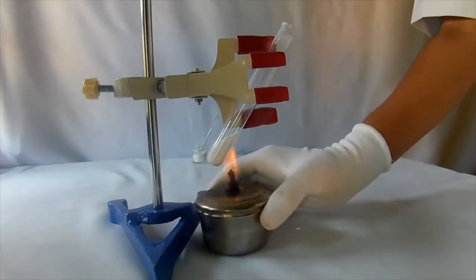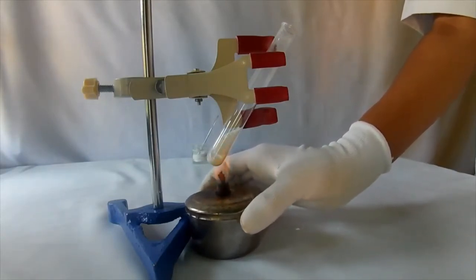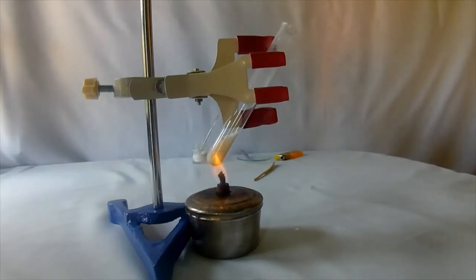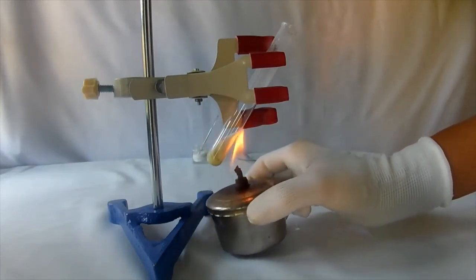Be careful while performing the experiment. Observe the change in color of the salt. It slowly changes from white to yellow. Zinc carbonate on heating decomposes to form zinc oxide. Zinc oxide is yellow when hot.